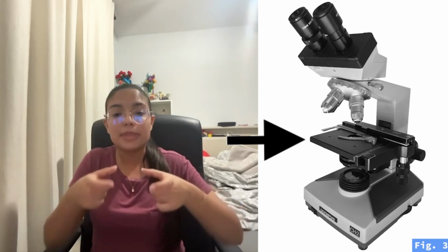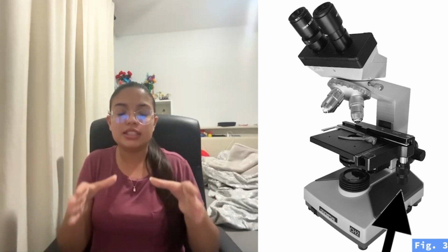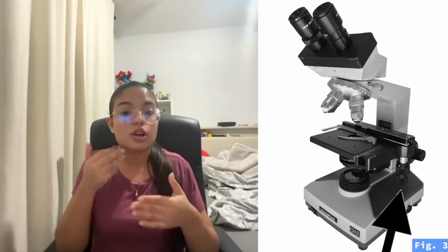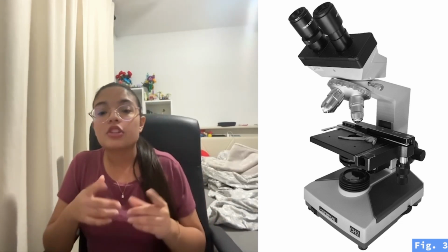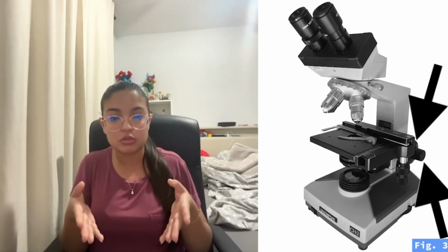And then you have the stage that keeps the objects in place with a clipper and has knobs that let you control where you have it, so you have it at the place that you need so you can do your observation. Talking about knobs, you have 2 knobs on the side, a coarse adjustment and a fine adjustment that focus the image that you're viewing through your microscope so you can see the specimen in detail.